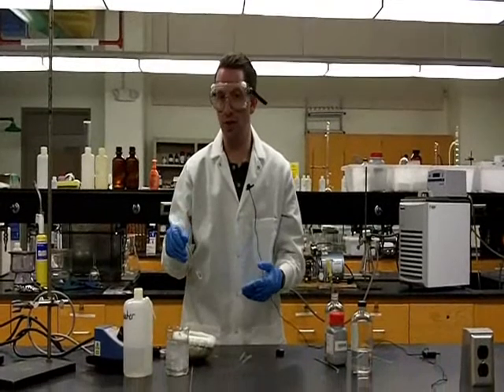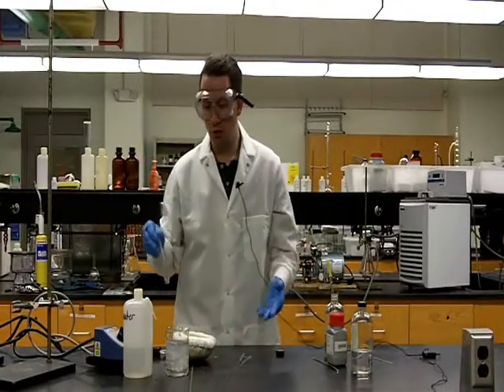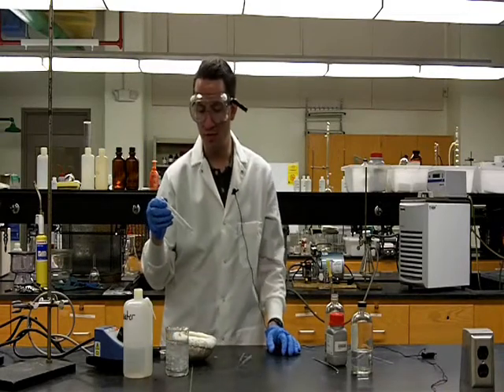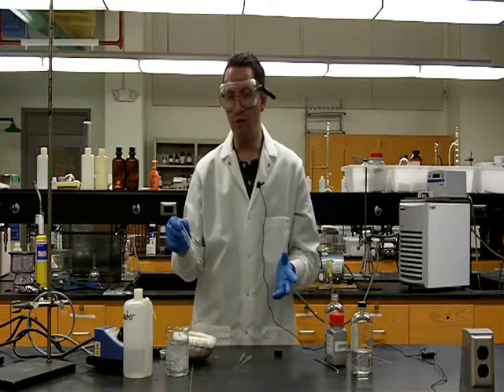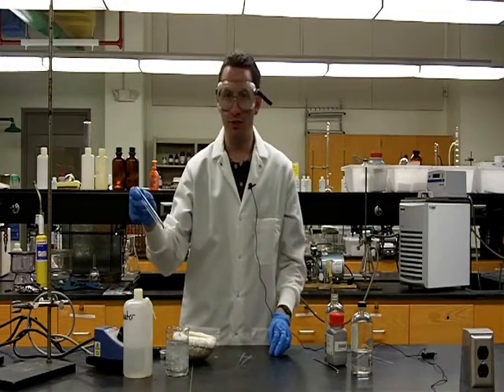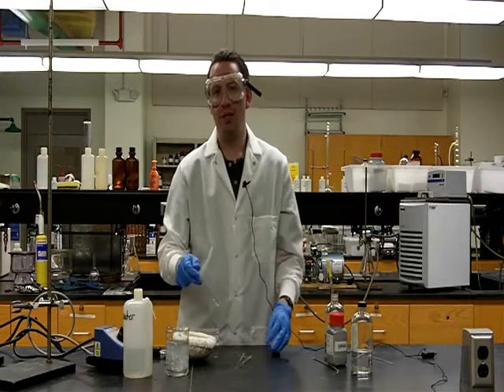So in terms of temperature, we have found that it's poorly soluble at room temperature, and good when it's boiling. So now we're going to cool it to room temperature and then cool it in an ice bath, and our final test is to see if our fluorene will successfully crystallize once the solution has cooled.